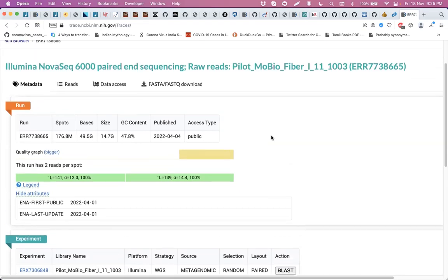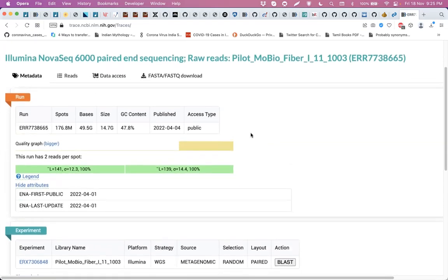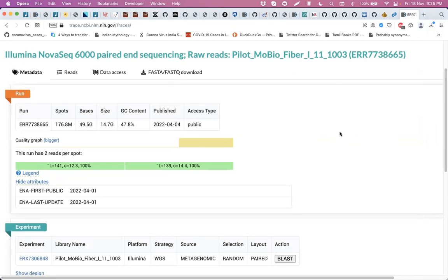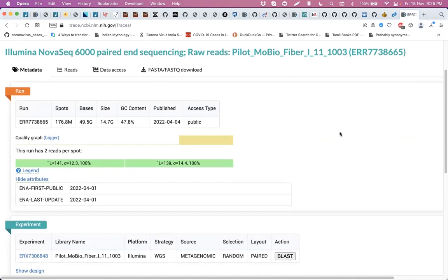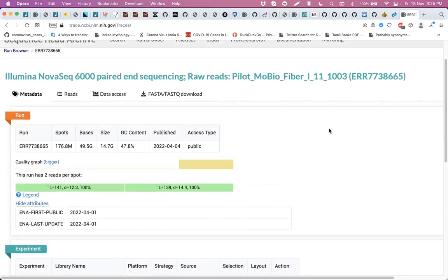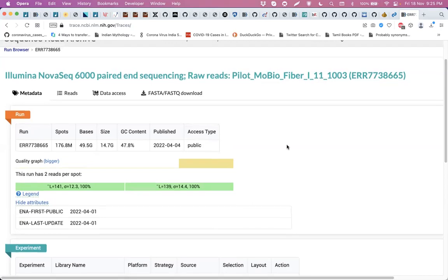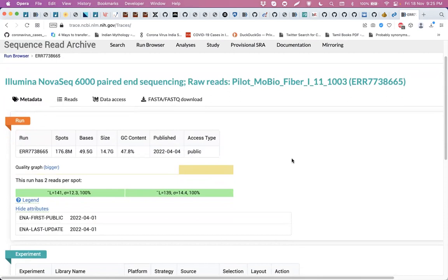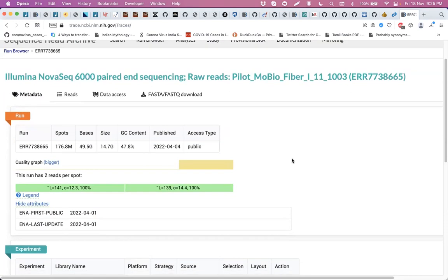Are you here with us? We cannot find out from here. So we should take the minimum read length here, so it should be 139. But then for all the samples, we have to take the average of the minimum. Yeah, that's what we should definitely do.